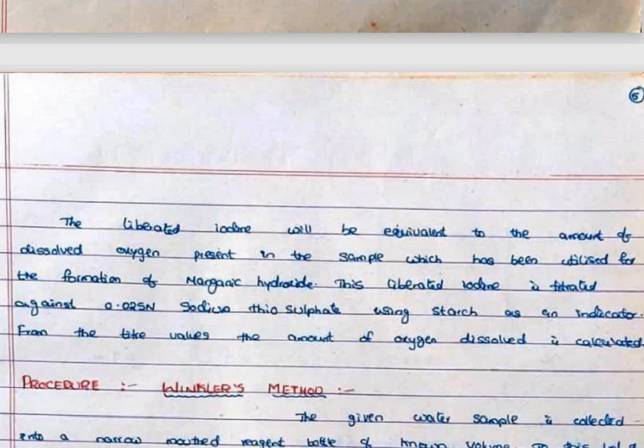From the titre values, the amount of dissolved oxygen is calculated.